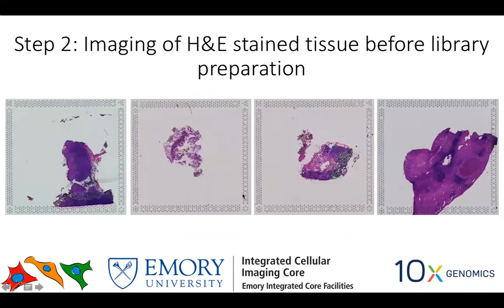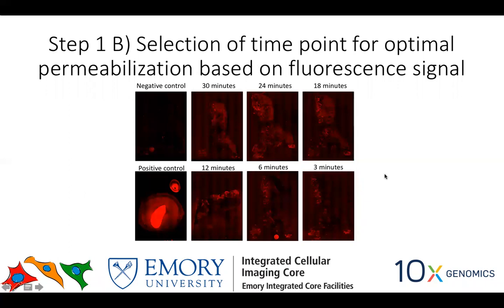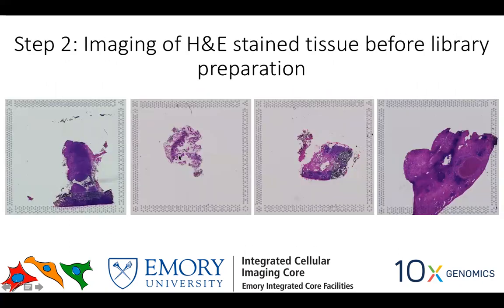and this actual step. Okay, so if there is any change in the handling process, the permeabilization time will differ when you are at step 1B versus when you're at step 2. So that is something which you will have to take care of.